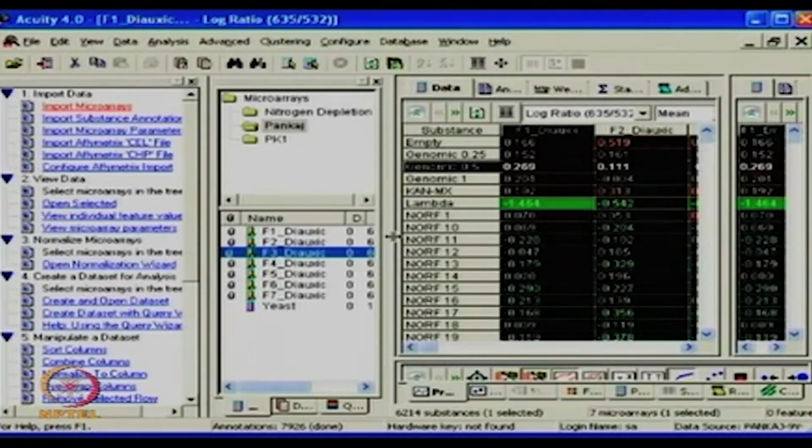Yeah. And it is not a thumb rule that which one is more preferable. One can choose anything, but make sure all your different slides are being handled in a similar way. Okay. And you can get the data and do analysis with different normalization processes also. Right. So one has an opportunity to even correct back.